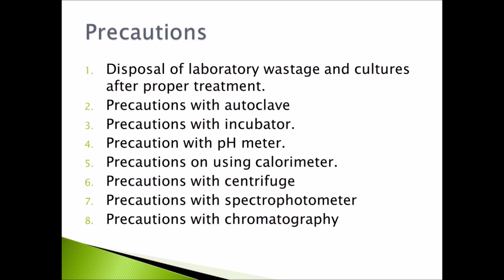If the instrument will not be used for a long time, the battery should be removed and the instrument should not be used in a high humidity environment.